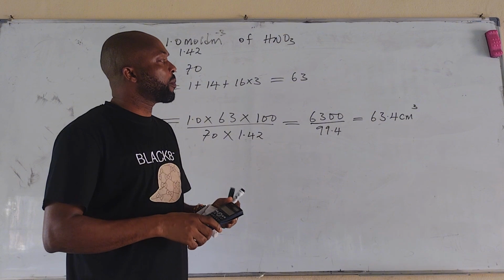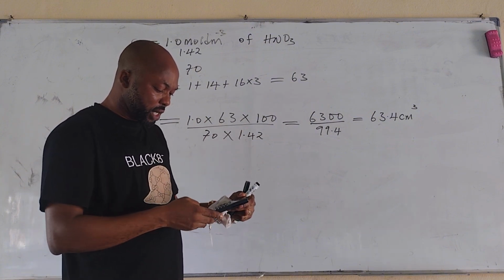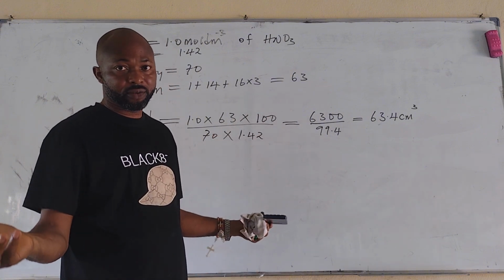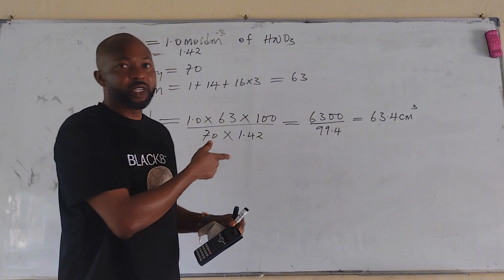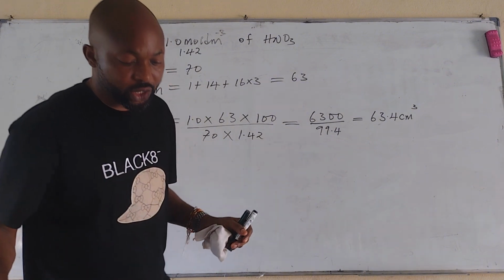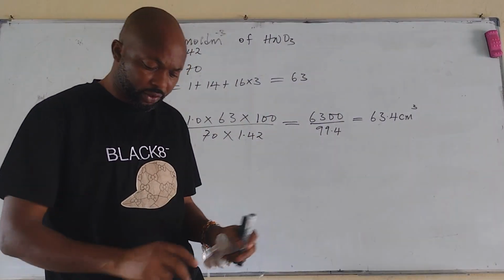But if there are just 2 or 3 students, you can divide that value by 4 and you have 15.8, which you dissolve in 250 ml. That saves you most of the reagent, because if you use 15 instead of 63, you save a lot of the stock solution. It's a way of preserving your reagent and not wasting money. Let's take another question.